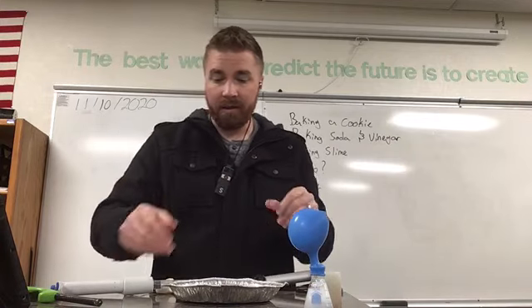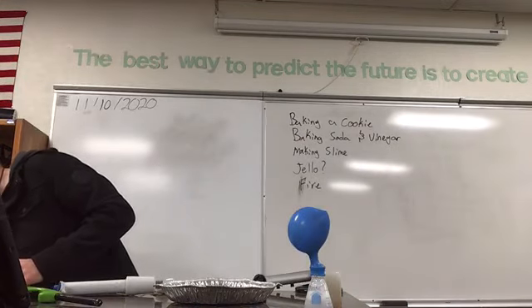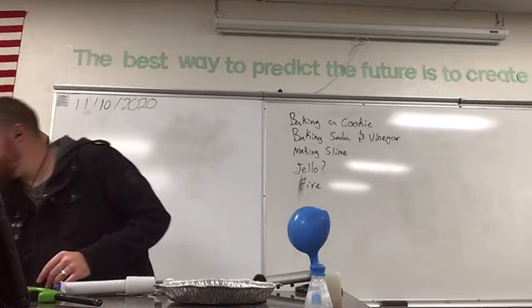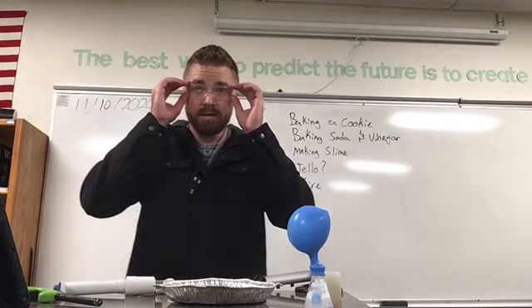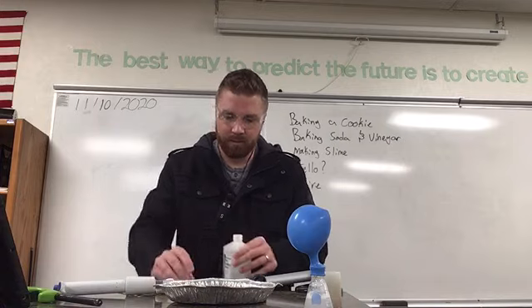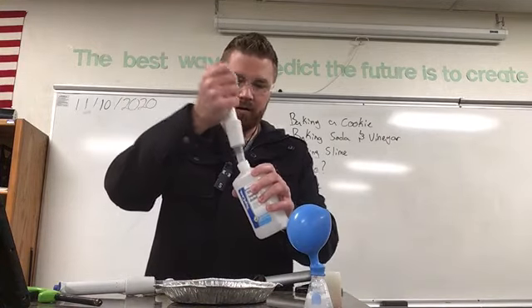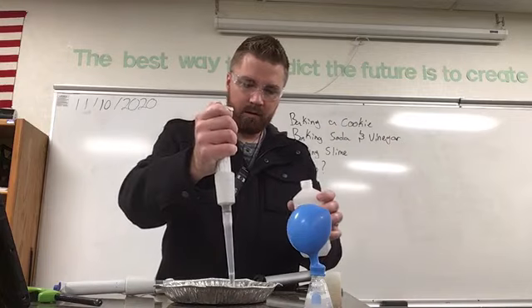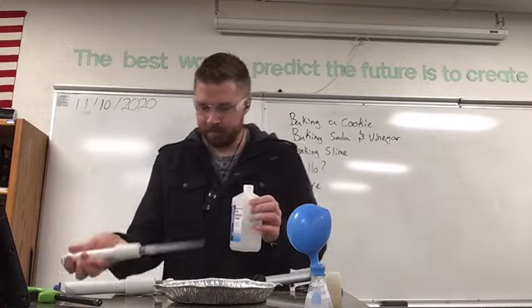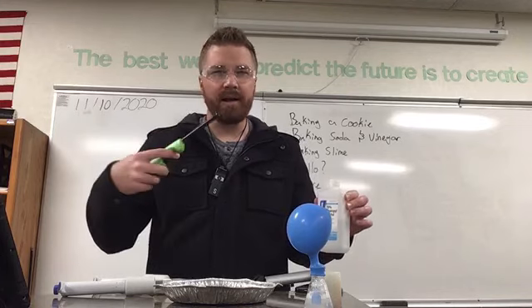Okay? The next one's burning alcohol. This is one where I really ought to be safe and make sure I have some safety glasses on. Okay? So I'm going to burn 1 milliliter of alcohol. Put that in there. Think about the properties of alcohol. How does it smell?